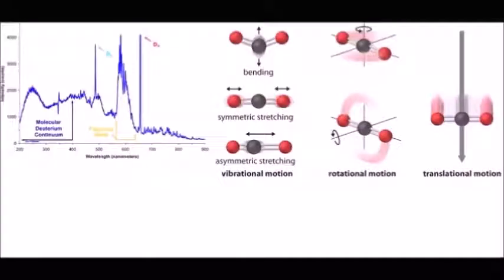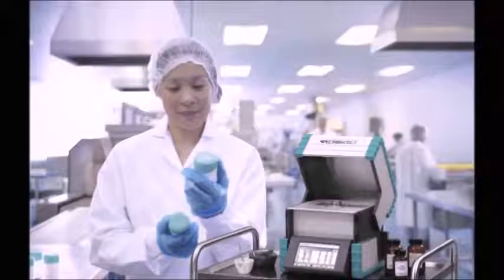Molecular spectra are very complicated because molecules don't possess transition energies of electrons only. They have rotational and vibrational energies too. So the spectrum doesn't appear as lines but as a large number of lines combined to make a continuous curve. See this figure. We will focus only on atomic spectroscopy and its application, so we can divide spectroscopic analysis into atomic and molecular spectroscopy, or absorption and emission spectroscopy.